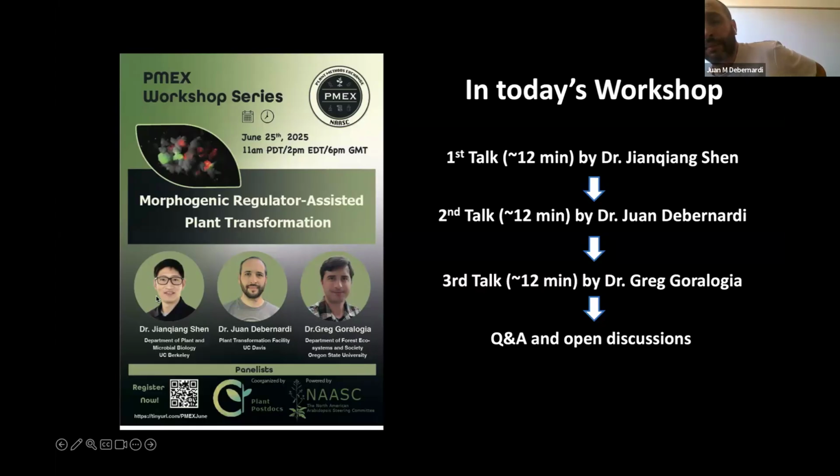Okay, good. So the utility that I found for that is that when we say that GRF-GIF plants have a normal phenotype, normally what we are trying to say is that the plants are fertile and you can get offspring or the T1 generation without problems.